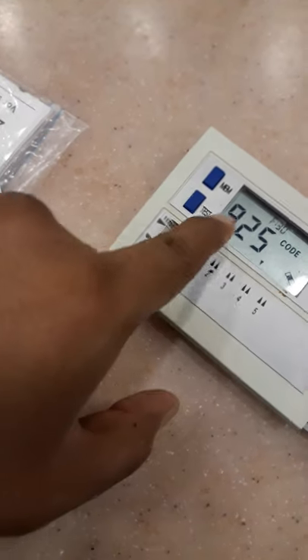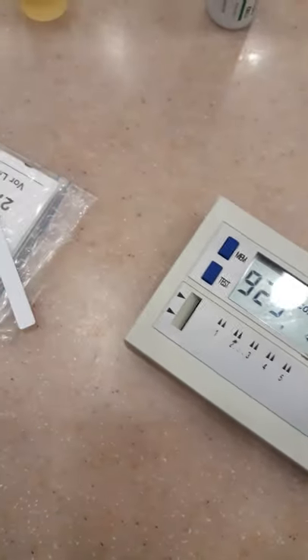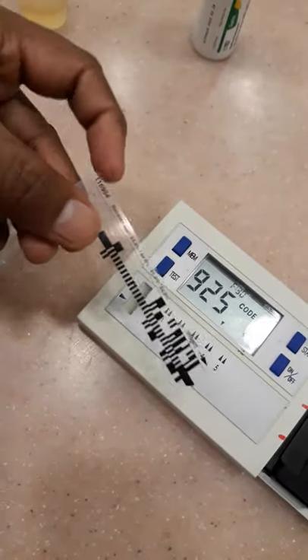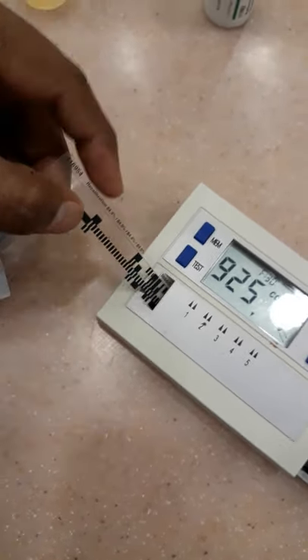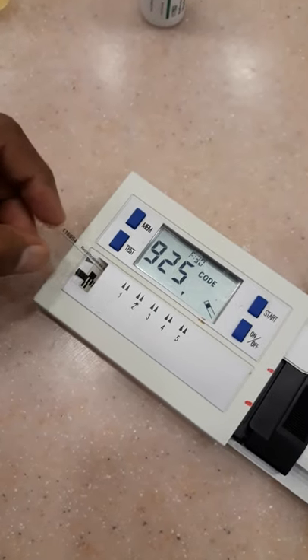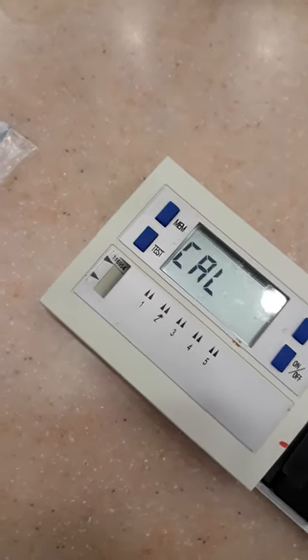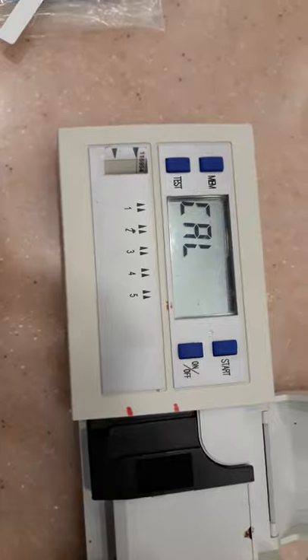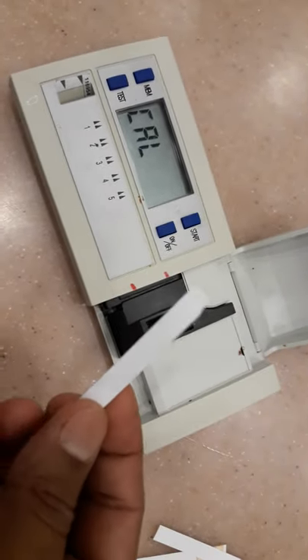There will be a sound, and then it will show the barcode 925, which means it's okay. After that, we need to insert the recalibration strip here. It will show 'calibration'.